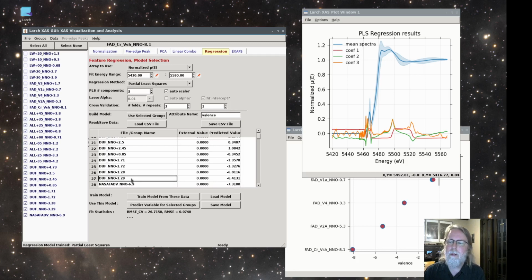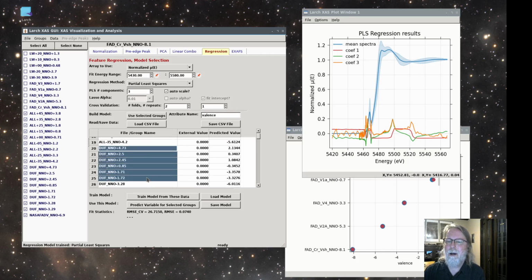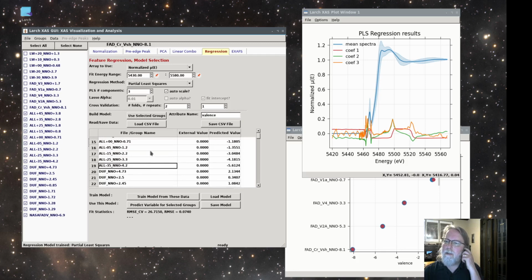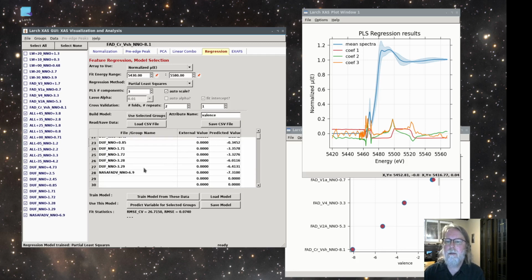Oh, here's a repeat also that those two should be about the same, and it is, but it's also pretty far off in log units, as if perhaps this data set, I'll say without any accusation, perhaps this data set should be investigated. Maybe there's a systematic difference between the way these samples measured fugacity and the other ones did. So for most of the other ones, it seems like there's just a reasonably constant offset of about ±1 log unit, and pretty good agreement over the scale. And for this one data set, it looks more systematically different.